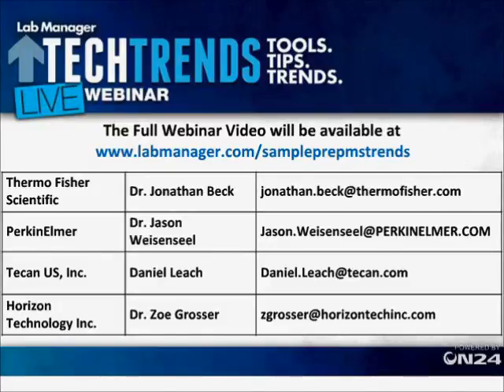What will drive future sample prep development? Do you predict revolutionary new ideas, or are we just going to see incremental improvements going forward? Trevor, that's a very good question. I can see there being some incremental changes. SPE has been around for such a long time, and there hasn't been any revolutionary change. I think it's been very much incremental.